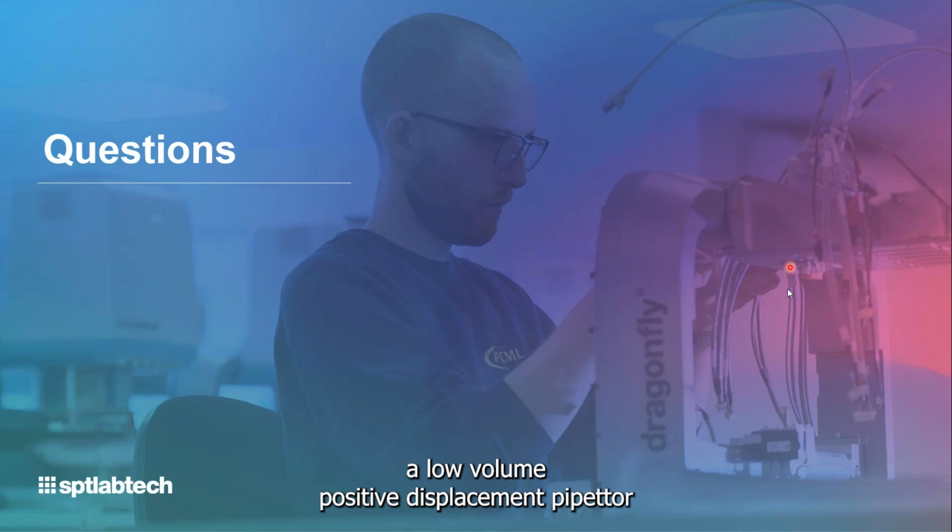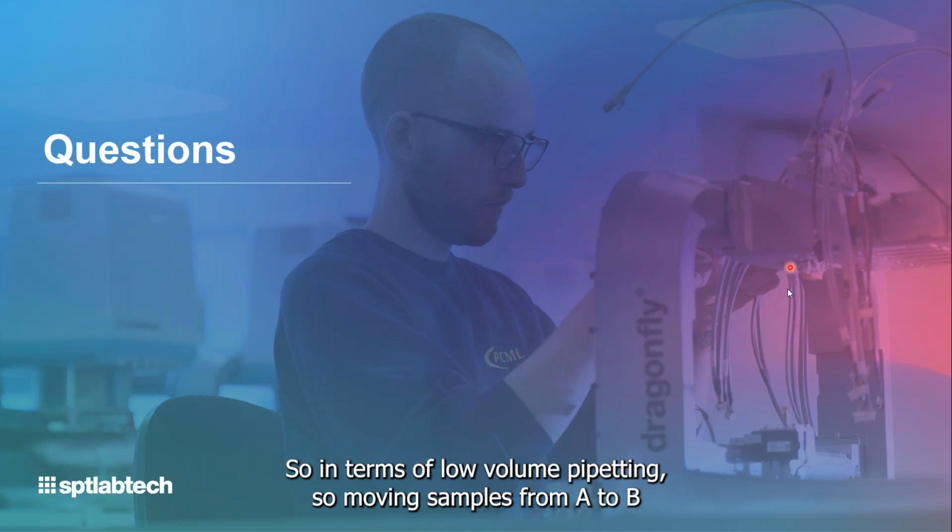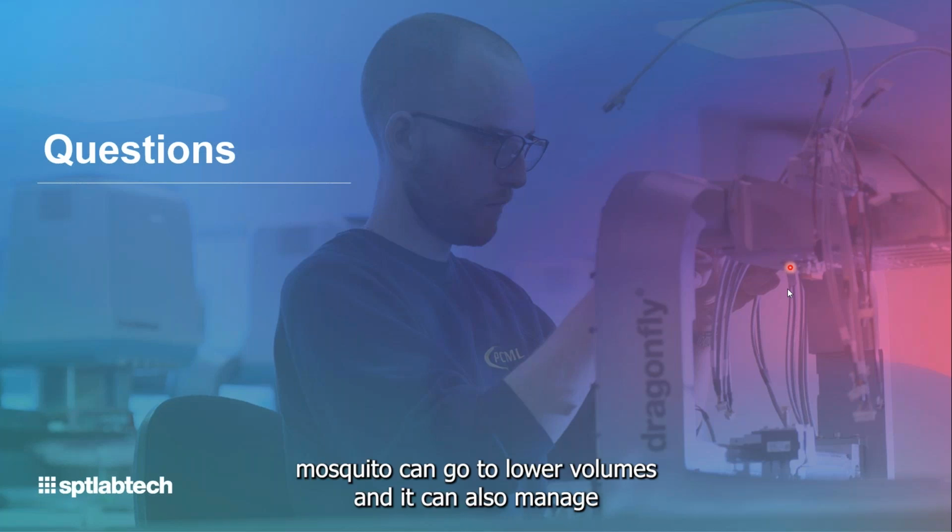The other thing, Mosquito is a low volume positive displacement pipetter. Firefly is using air displacement, standard pipetting functionality. So in terms of low volume pipetting, moving samples from A to B, Mosquito can go to lower volumes, and it can also manage more challenging liquids.